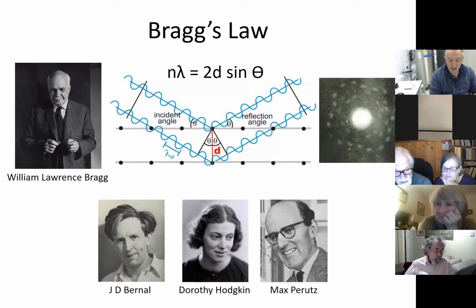Now, Max then went on in subsequent years to work out how to go from these diffraction patterns of protein crystals to actually solving an atomic structure of them. And it turned out that protein crystals, as you'll see in the next few slides, have much more complicated diffraction patterns. But from them, you can work back to the actual structure.